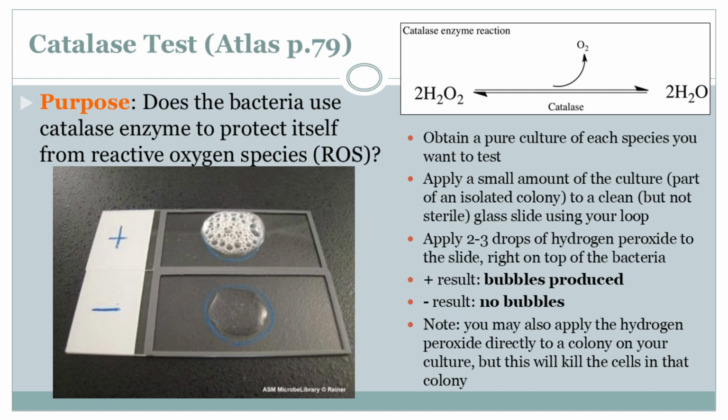But then you have catalase-negative bacteria. They don't produce catalase, so they don't make those bubbles when you add hydrogen peroxide. And that tells us they might prefer living in environments with less oxygen. So like deep inside our gut where there's not as much oxygen. Exactly. Or in soil deep underwater, places where oxygen isn't as readily available. Wow. So these bubbles are like little clues telling us where these bacteria like to hang out. That's wild. And you said this helps doctors diagnose infections.